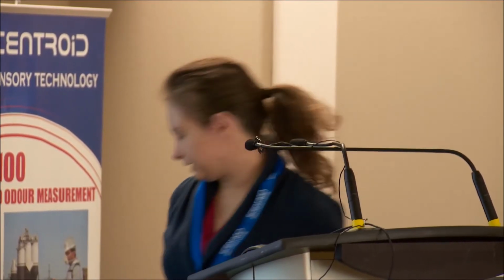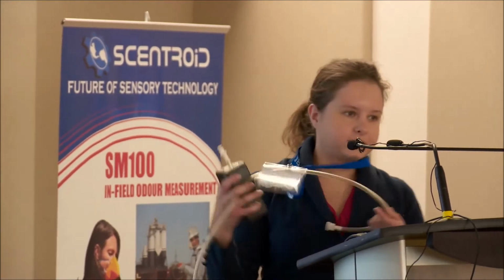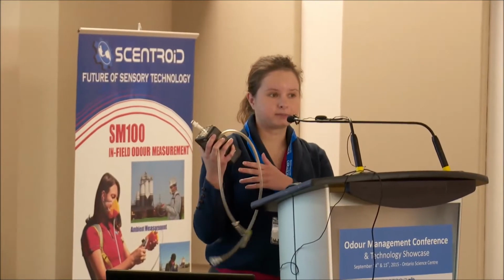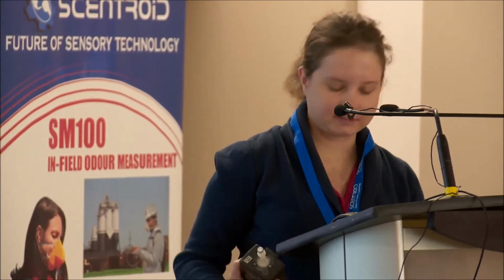You can also look at something with the sorbent material, so you've got a pump. This is a little bit more cumbersome because you're going to have to calibrate this pump. It's a little bit more work. But again, it also has its advantages.